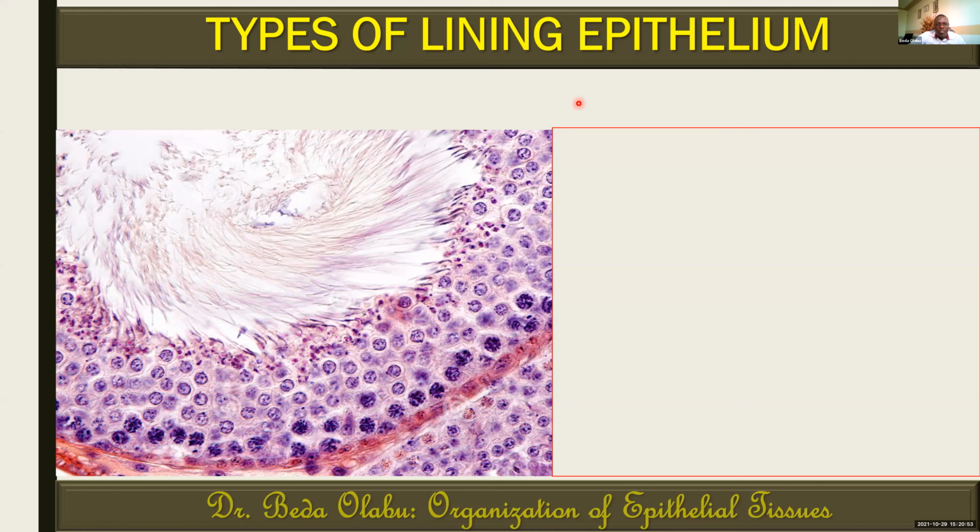Perhaps before we give it a name, I give you a chance to just write on the chart how you classify this epithelium. I've made the chart in such a way that I'm the only one able to see what you're going to write. So feel free and write something. Just identify the epithelium. Let me call this one question 1 to help me distinguish what you've written so far.